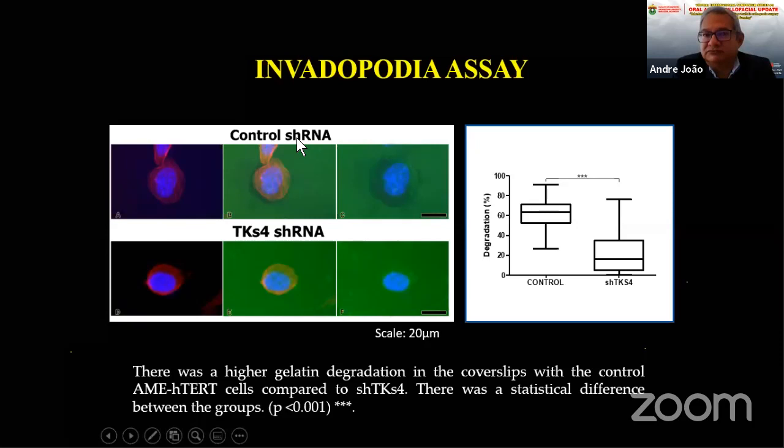This is the control, cells without the knockout for TKS4.